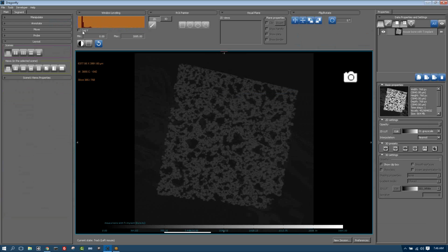We can see if we take it on a linear plot that really most of the pixels in this data set are occupying this very small band right here. Now the way we adjust brightness and contrast, there are a number of ways of accessing it, but basically you're adjusting how the color lookup table that you're using is being mapped onto this histogram. So in fact, I'm going to change a preference here.